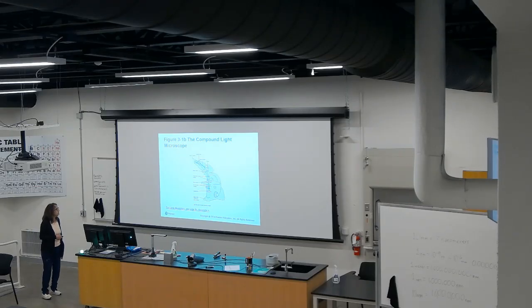And this is the pathway of light of the compound light microscope. So everything starts here in the illuminator with several rays of light going parallel towards this condenser lens that condenses the light specifically into the level of the specimen that is found typically in a glass slide.